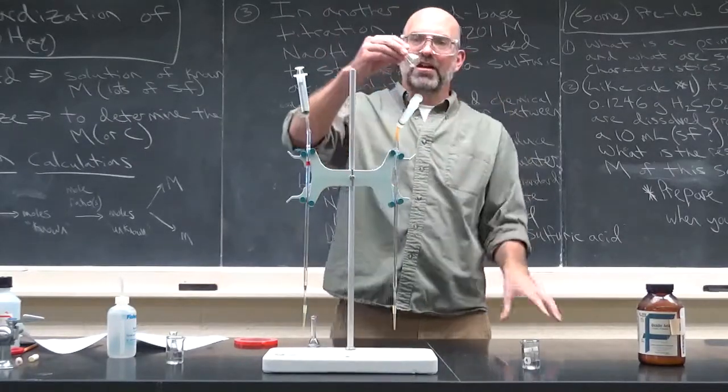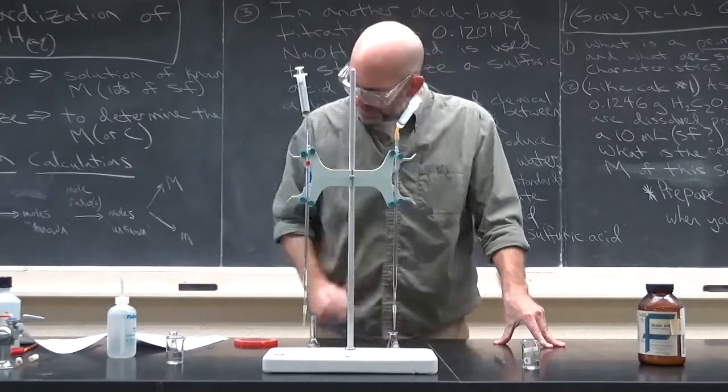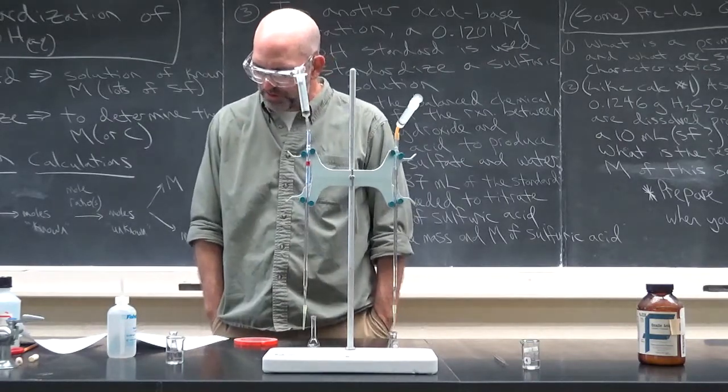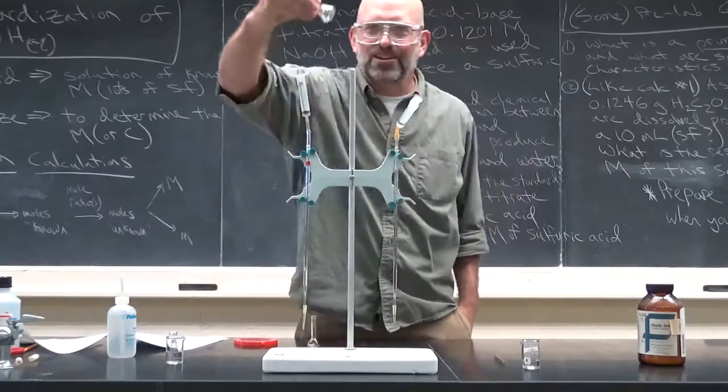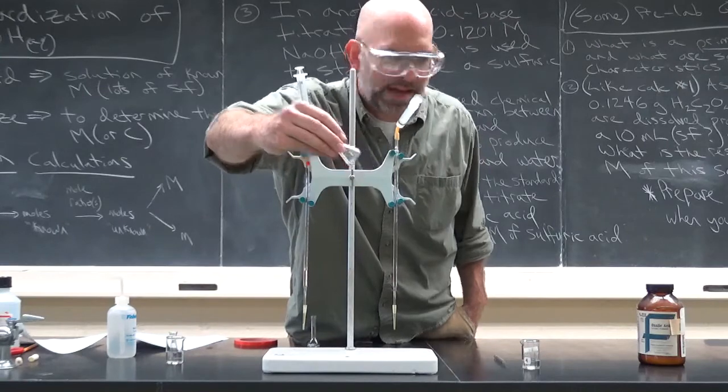So, you have a very small amount of oxalic acid in here. And then it says to do what? Using a graduated cylinder, measure two milliliters of water and place it in the flask. Okay. This is, I don't even know if you can see that. There's hardly any liquids. There's hardly anything in there. It's really going to be hard to see in the chemical reaction. So you add some water.